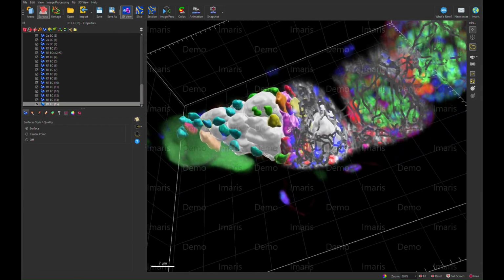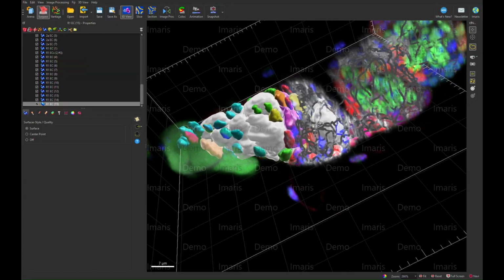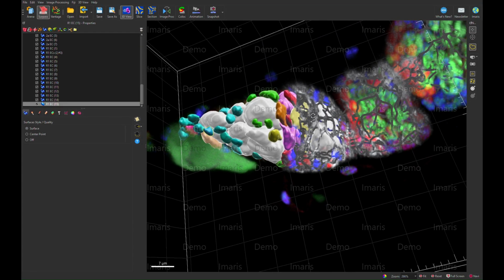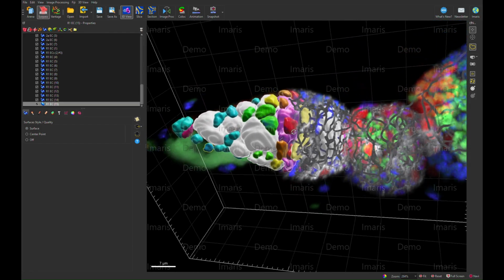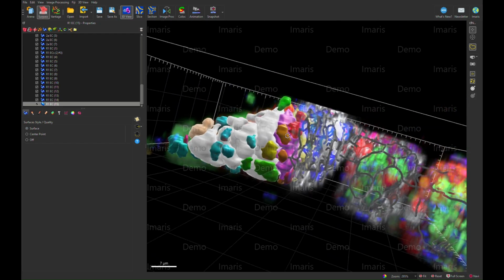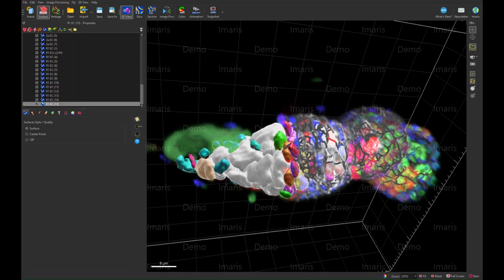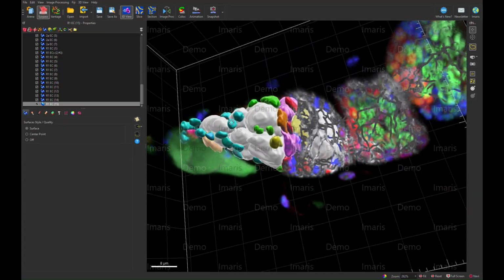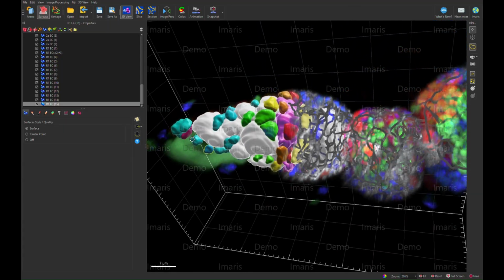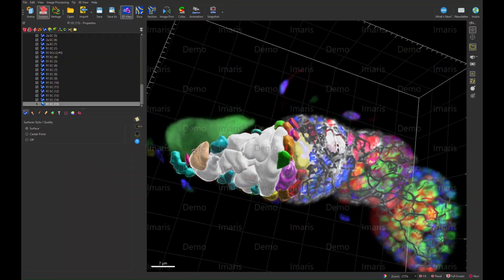We have the Fas3 border with our red layer 1 cells, our orange layer 2 cells, and our yellow layer 3 cells. Right there, see they're abutting that Fas3 protein but not surrounded by it, as well as the pink 2B, it's abutting that Fas3 but not surrounded by it. Whereas the yellow transitioning 3 cyst is surrounded by it, and the 2A cysts are further anterior, surrounded by the green escort cells, and even further anterior you have the region 1 cysts being surrounded by the region 1 escort cells. Okay?